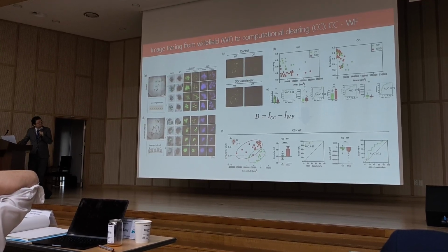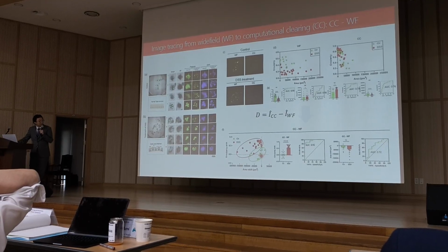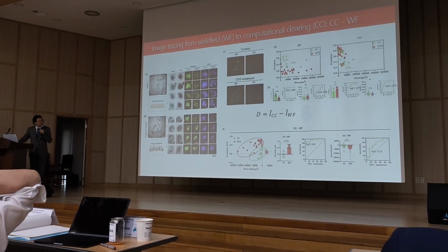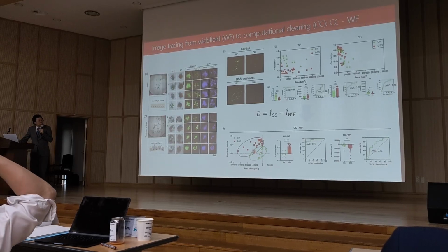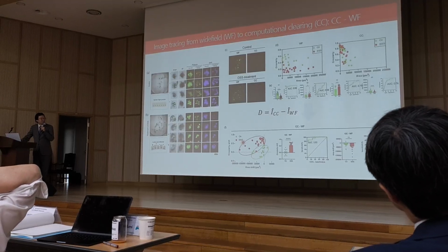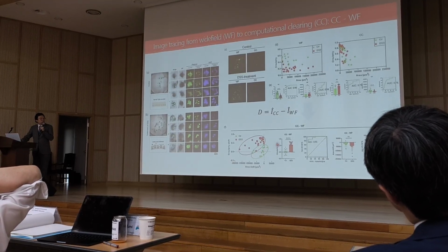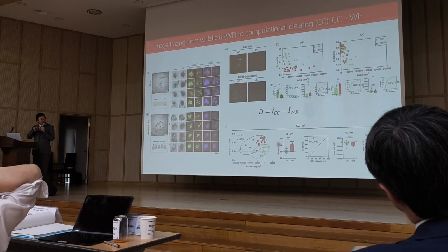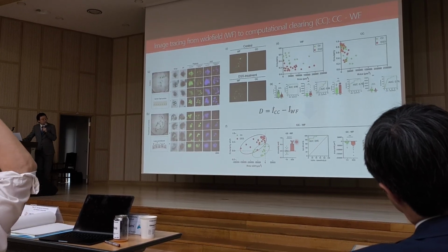In control samples, the shift is not that high, almost distributed at 0.0. However, the DSS treated ones show some shifting after image processing. Based on this, we could do a phenotyping diagnostic application to distinguish two different phenotypes.